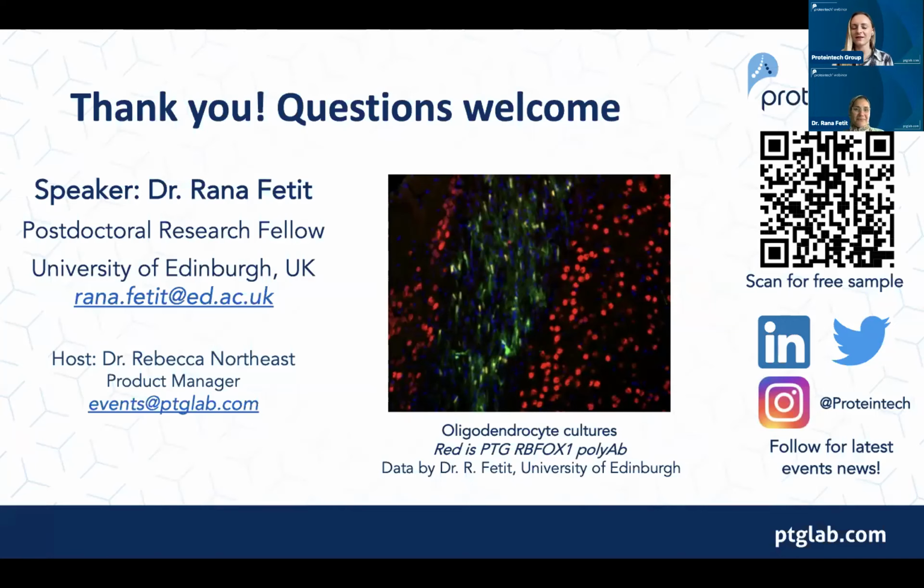So one of them is a general question about oligodendrocyte cultures. Can they myelinate neurons in culture? That's a really good question. There have been reports of co-culturing them, with a paper showing that there is myelination in vitro. We are working on that at the moment in our lab. We're trying to grow them with different interneurons to see whether that occurs or not. So in our hands, it's still a work in progress.